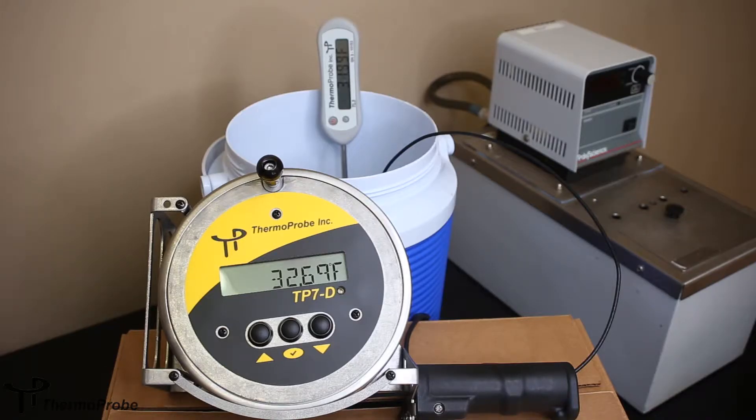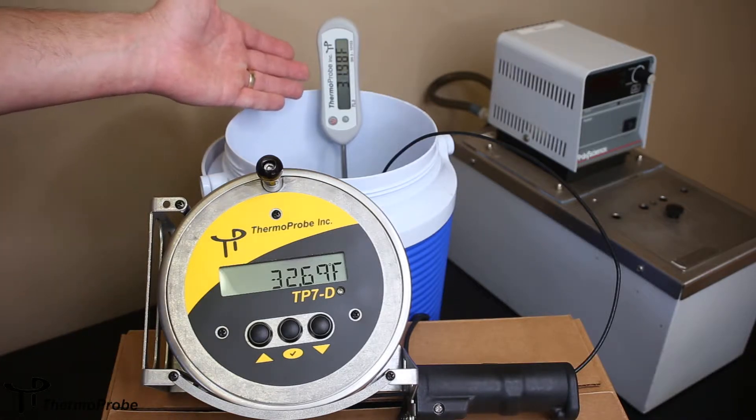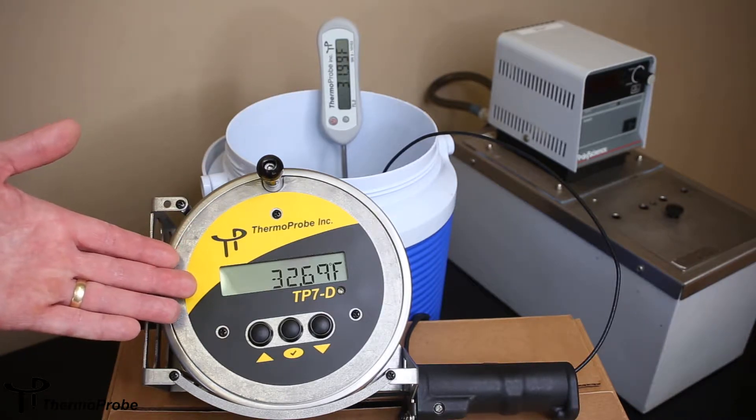This is an illustration of how to do a calibration adjustment to a TP7D or a TP9A. The equipment needed in this case will be an ice bath, a calibrated reference — in this case a TL3 — and obviously the gauging thermometer that needs to be adjusted.